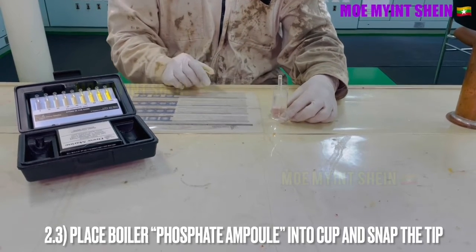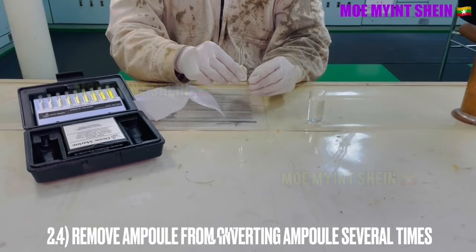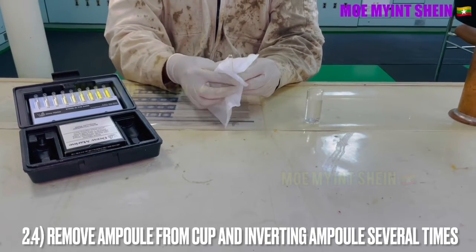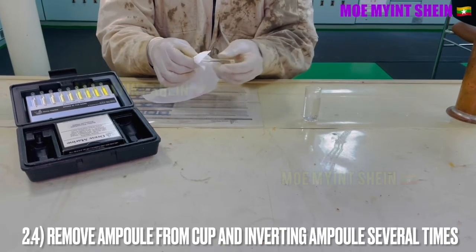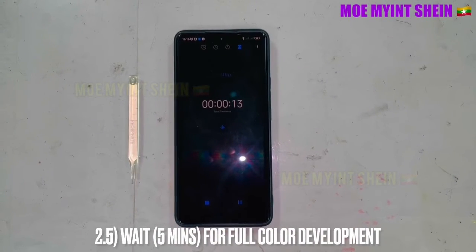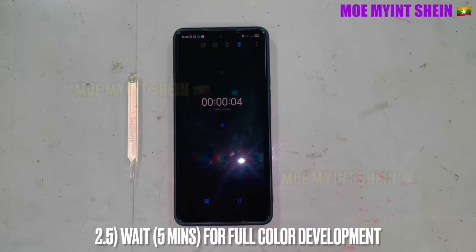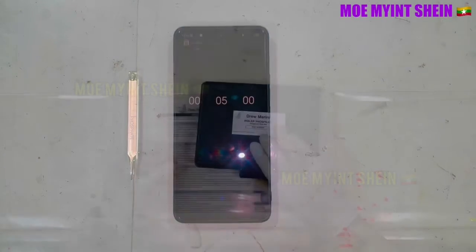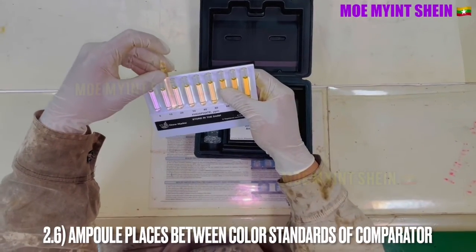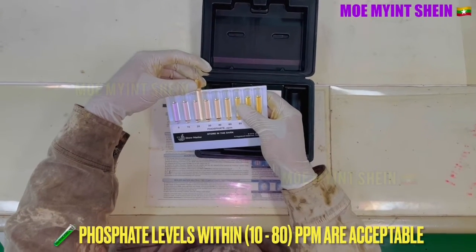Place the phosphate ampoule into the cup and snap the tip of the ampoule. Pull out the ampoule from the cup and invert it several times. Wait 5 minutes for full color development. Place the ampoule between the color standards of the comparator. A phosphate level of 10 to 80 PPM is acceptable.